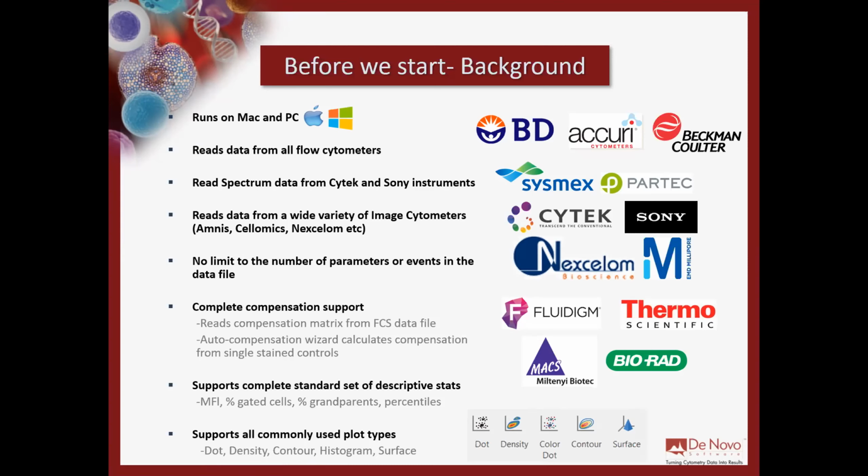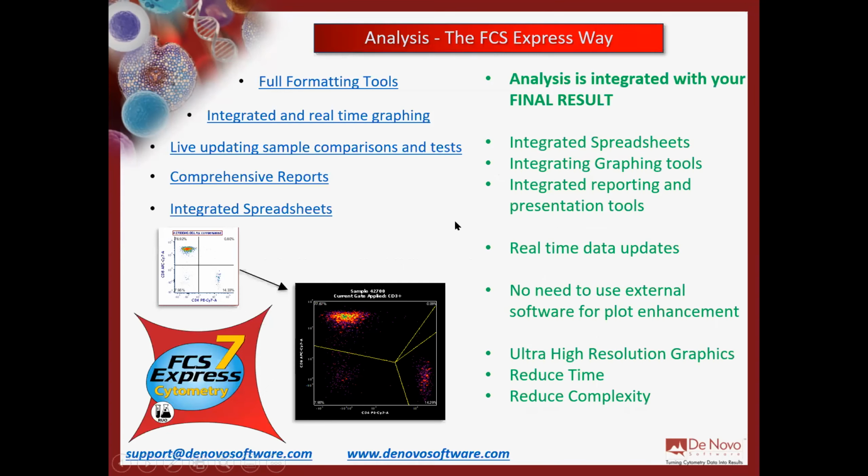For instance, if you're used to working with zebra plots in FlowJo, you come into FCS Express and say, oh, where's the darn zebra plot insert button? We don't have one because we don't call it a zebra plot. We call it a contour plot with black and white stripes. So maybe the name isn't as cool, but the visualization is there. And again, if you can't figure out where it is, write us a question at support. We love those questions. We can answer those in about 30 seconds. They're very straightforward, so make sure you keep those questions coming.